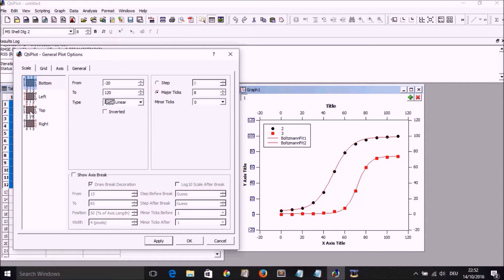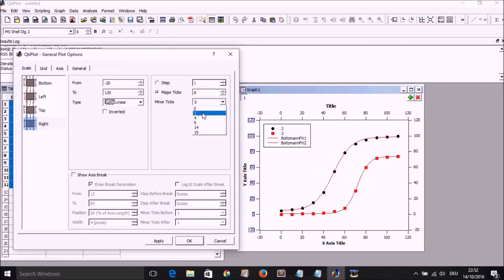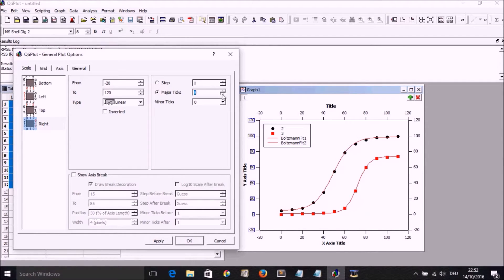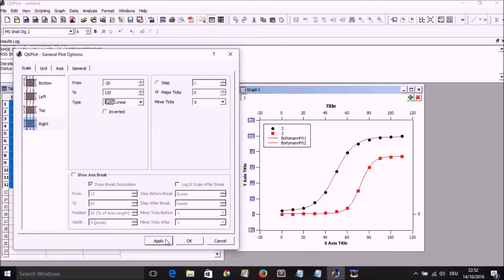Now on the right axis, we may want to make it have no ticks, so we put minor and major ticks at zero altogether and select apply.